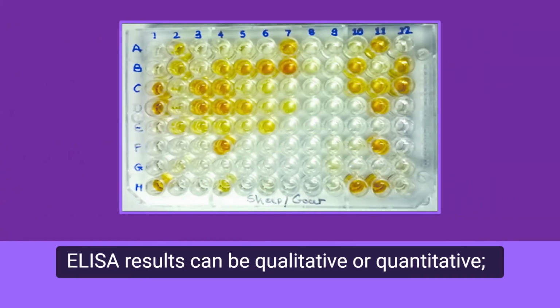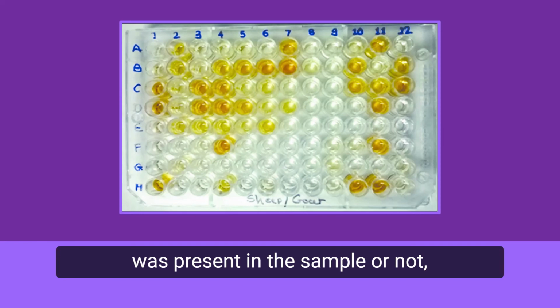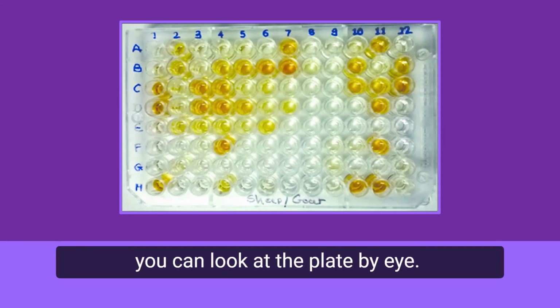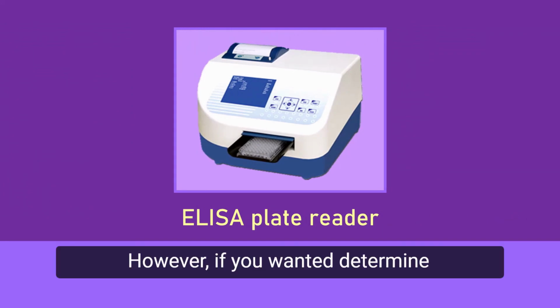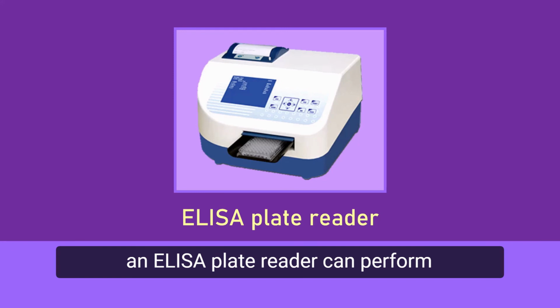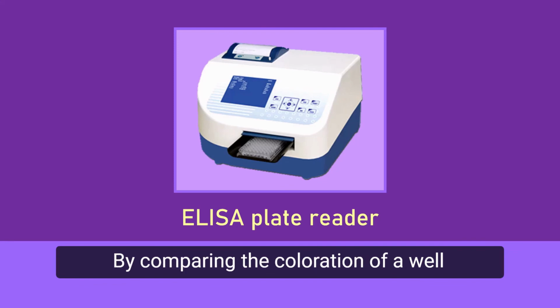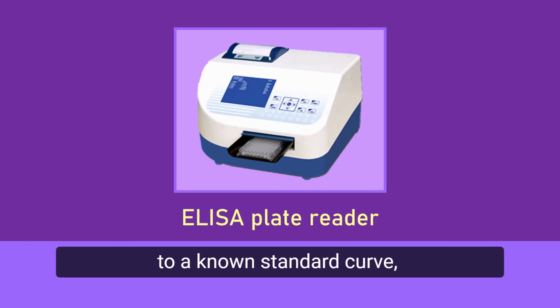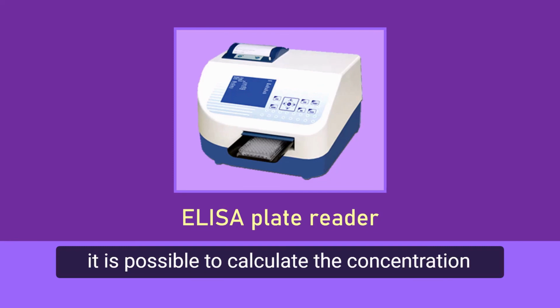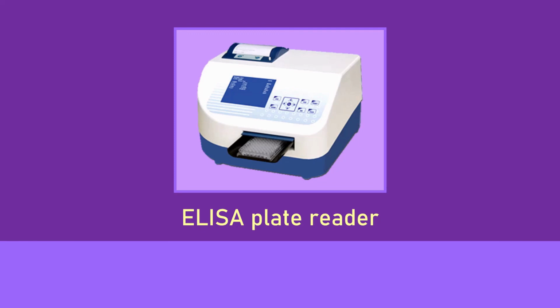ELISA results can be qualitative or quantitative. If you simply want to know if the target protein was present in a sample or not, you can look at the plate by eye. However, if you want to determine how much target protein was present, an ELISA plate reader can perform a spectroscopic analysis of each well. By comparing the coloration of a well to a known standard curve, it is possible to calculate the concentration of the target protein in the original sample.